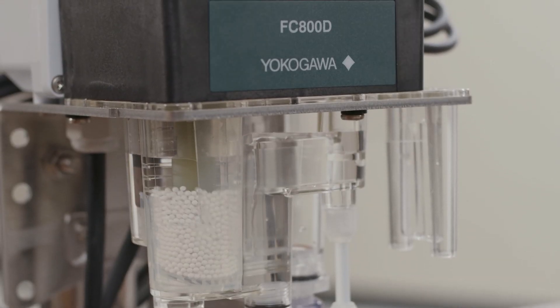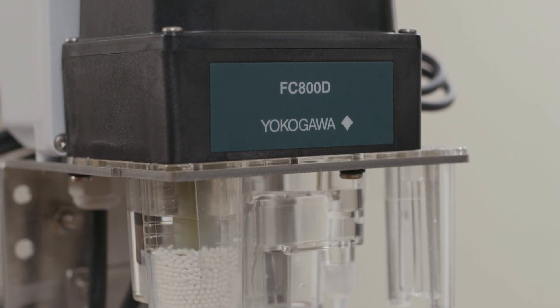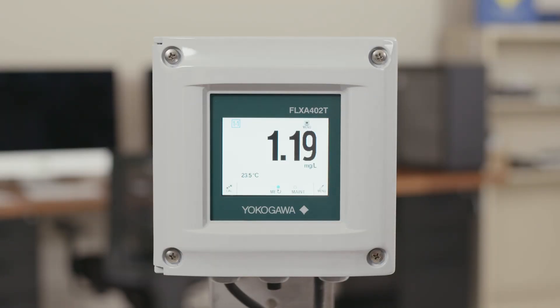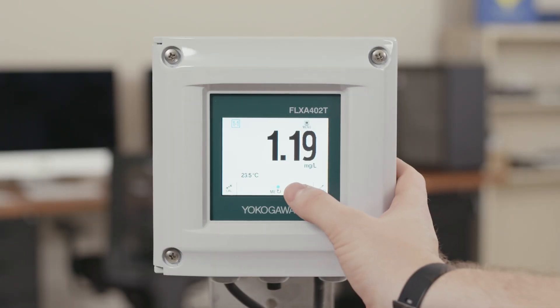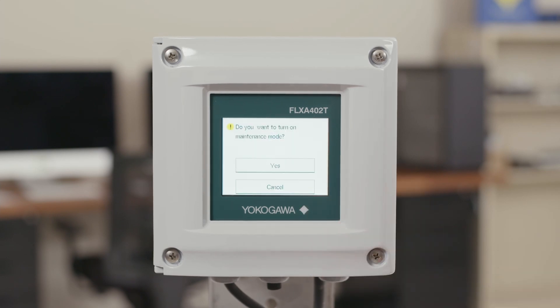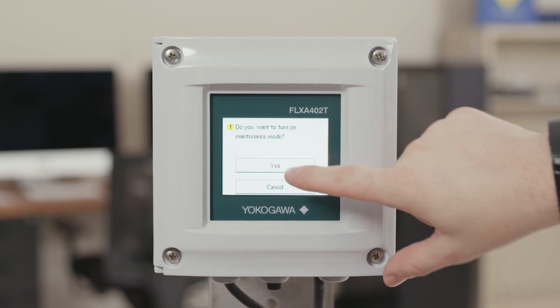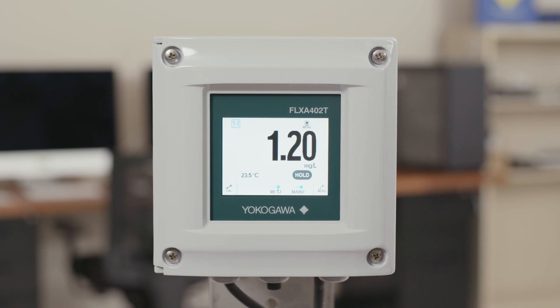To start your calibration, the first thing you want to do is switch your analyzer into maintenance mode. On the home screen you can press the maintenance button. A dialog will pop up asking if you want to turn on maintenance mode. Select yes and it is now in maintenance mode. This way the operator knows that the analyzer is not measuring correctly and does not have any issues.